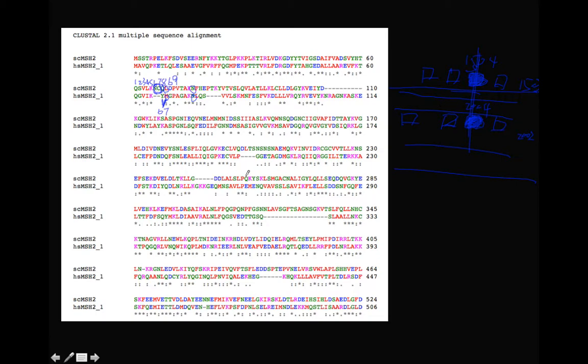And we come back to the human and yeast alignment again. So for the human C333, we found it here. So that's human C333. In yeast, it's also a cysteine, but the yeast position is 345. That's really the key. If we want to go back and find the codon position, remember each codon is 3 nucleotides, so we multiply by 3.